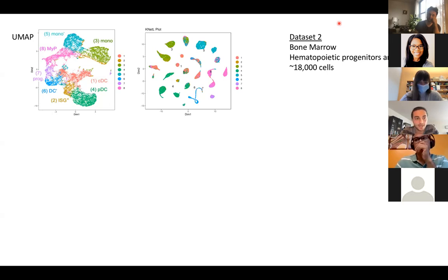Actually, part of what I was saying about how much time we had spent with UMAP was exactly in this process. We had done multiple iterations of the UMAP analysis, and even before that with tSNE. Although the most extensive analyses we had done were with UMAP. And what we found was that even if we try to get better resolution on the entire data set, we could never do better than this, first off. And also, when we honed in our analysis on just cluster 6, for example, or even on this half of all of the populations, we still couldn't break up our cluster of interest into more refined, biologically relevant populations.